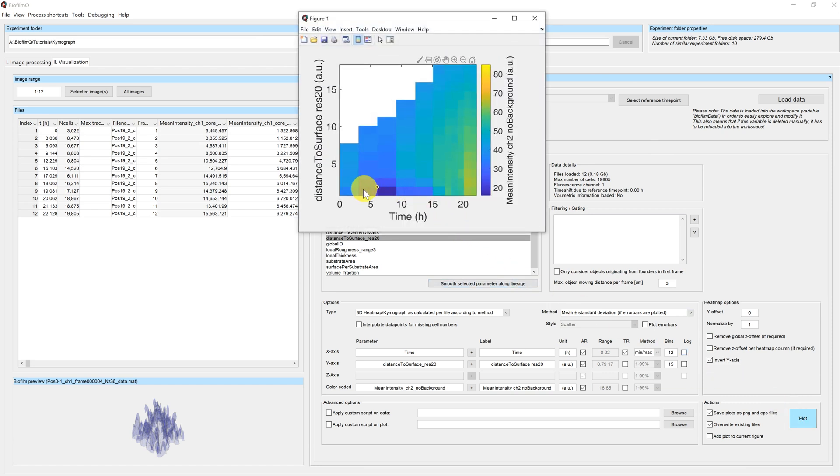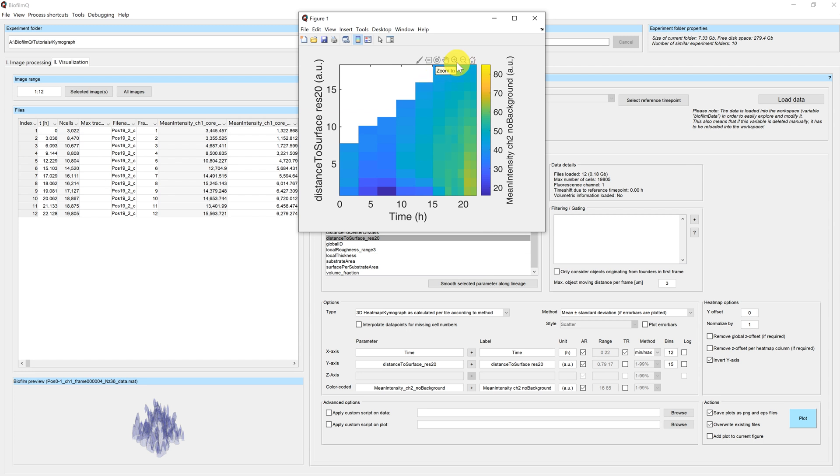And therefore, we now have the biofilm center here and the outer area of the biofilm here, which is easier to understand.